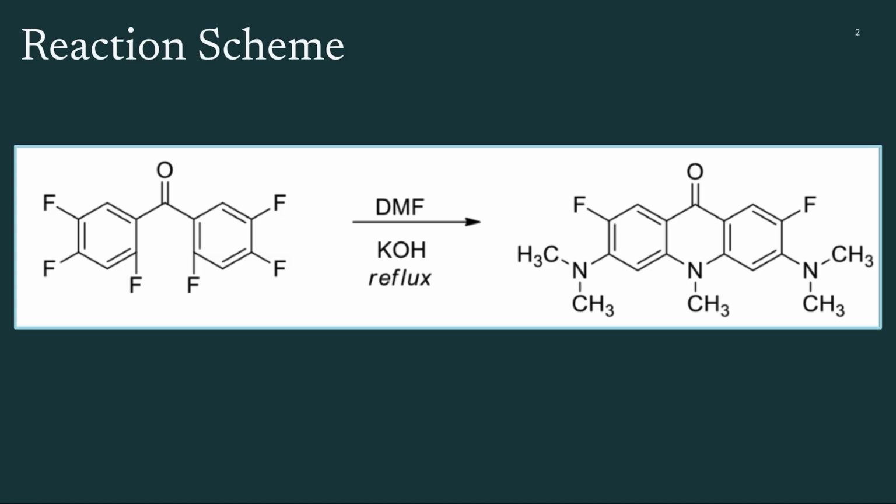You can see that the starting material undergoes nucleophilic aromatic substitution under strongly basic and high temperature conditions to form the acridone product. This reaction is well documented in the literature, so my goal was to explore whether these changes in time and also in solvent used could optimize the reaction under our lab's constraints.